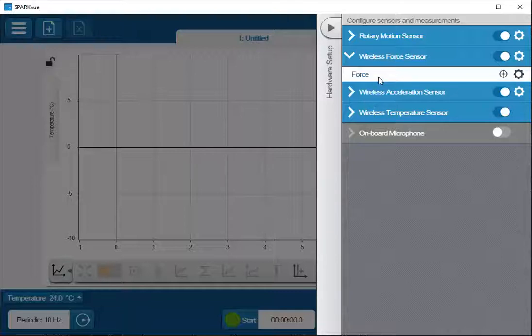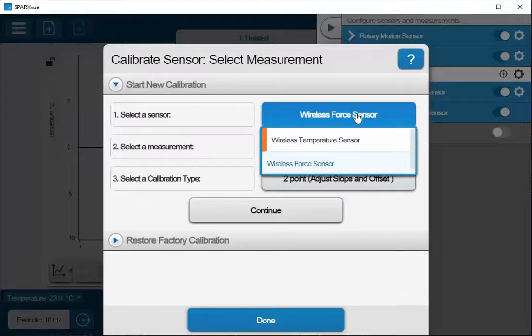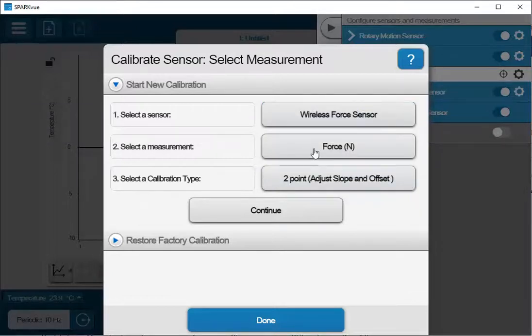Something that's different about the sensor is I have this crosshair here. If I hover over this, I can see that I can use this to access the calibration for this measurement. If I click on this icon, I'm then presented with a calibration screen for this sensor. I can actually also navigate to other sensors within this menu. So the configuration on the screen will be for that sensor, and specifically how to calibrate that will be walked through for this screen.